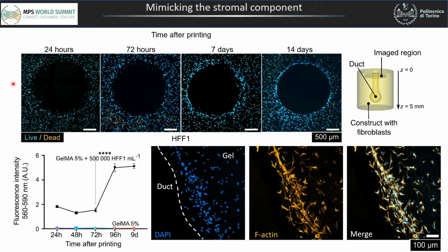The viability of fibroblasts inside the bioprinted construct was assessed by observing the state of the cells, and these live-dead images show that most cells survived after the biofabrication process, and they were homogeneously distributed in the gel after 24 hours. The proliferation and growth occurred, as confirmed by the metabolic activity, which increased with time.